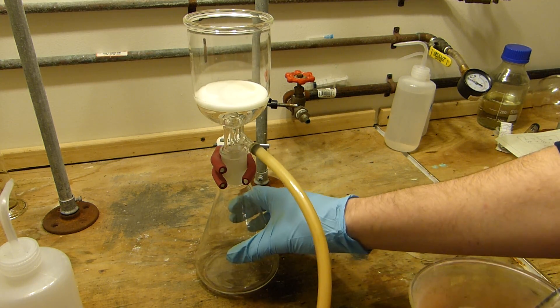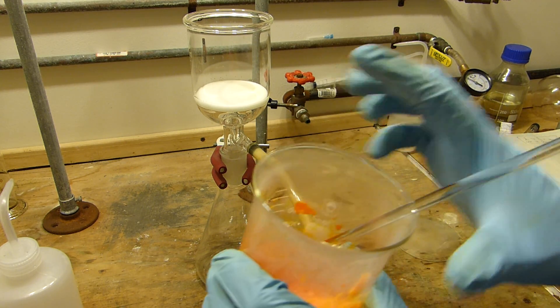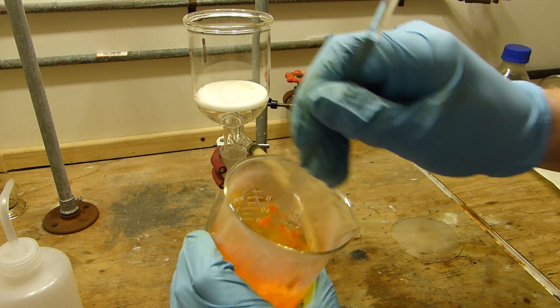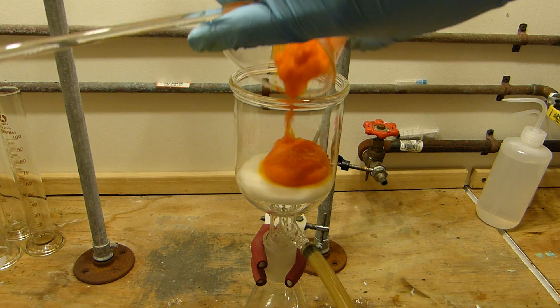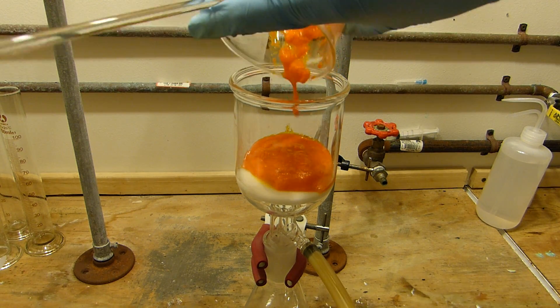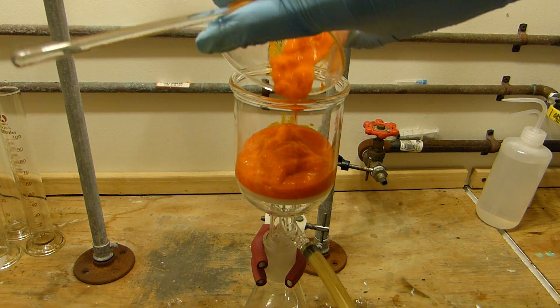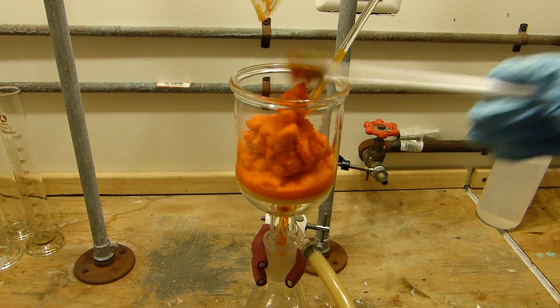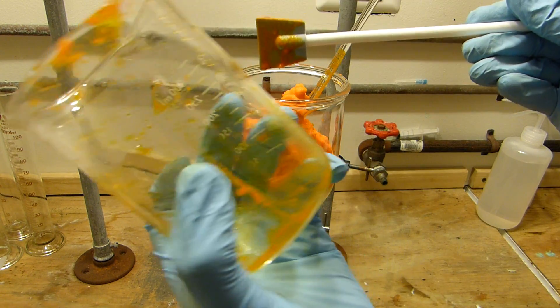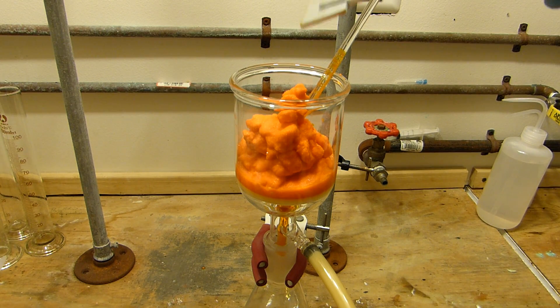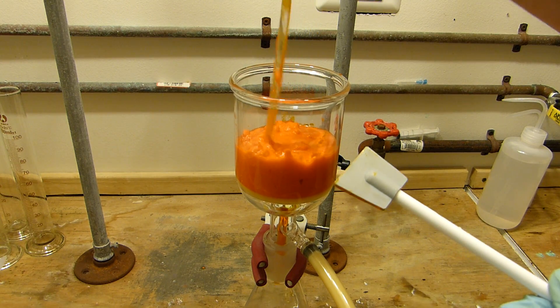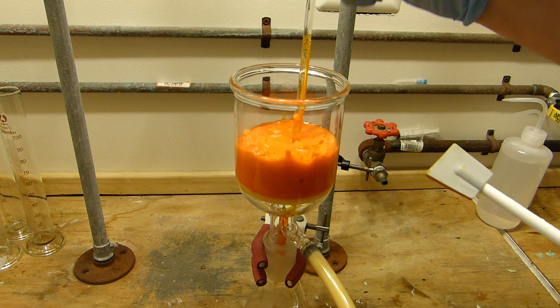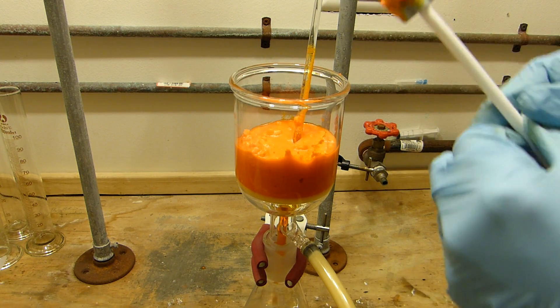As you can see I've set up for vacuum filtration and we'll just quickly pull the supernatant liquid off of this precipitate. All right that's about as good as I'm going to get the beaker. So I'll push this down to settle it out and we'll start the vacuum and suck the liquid out of this. Solution is already dripping through.